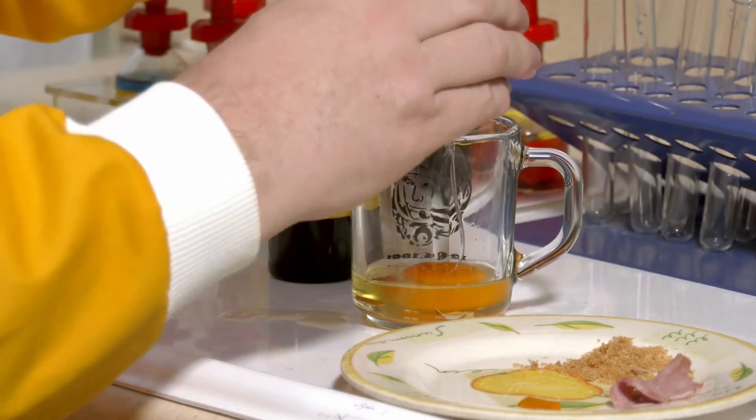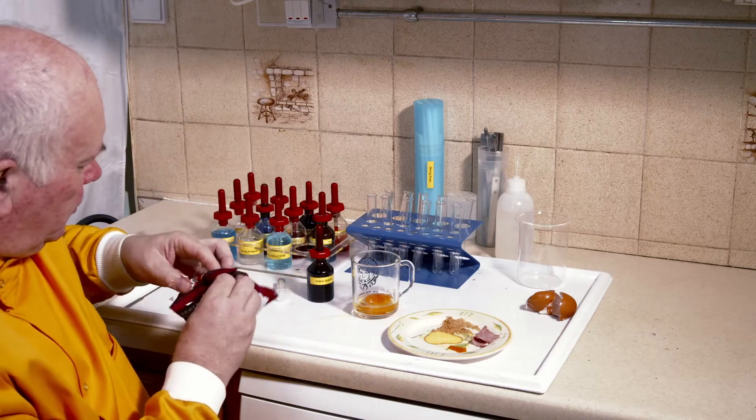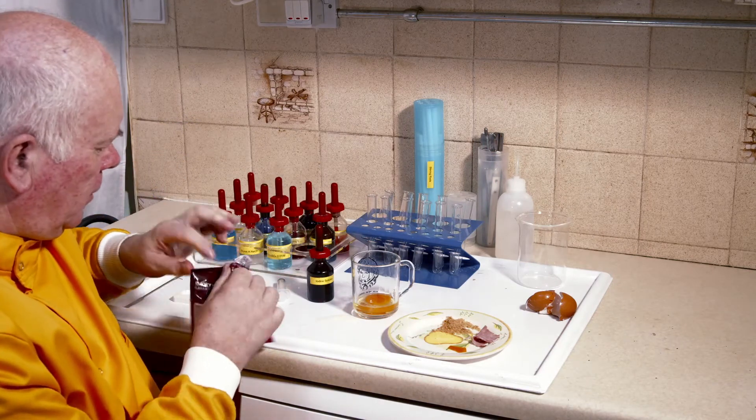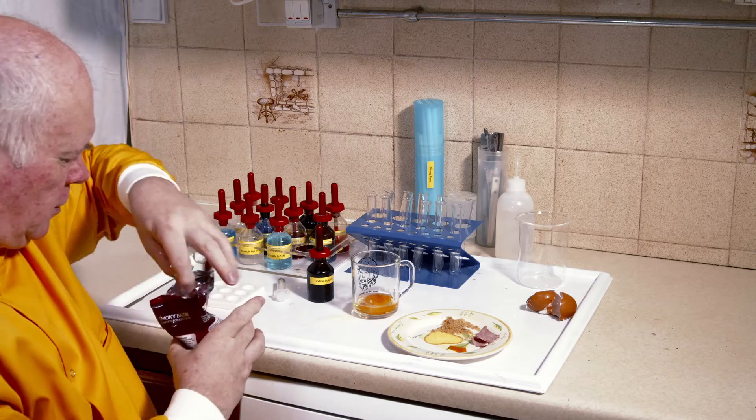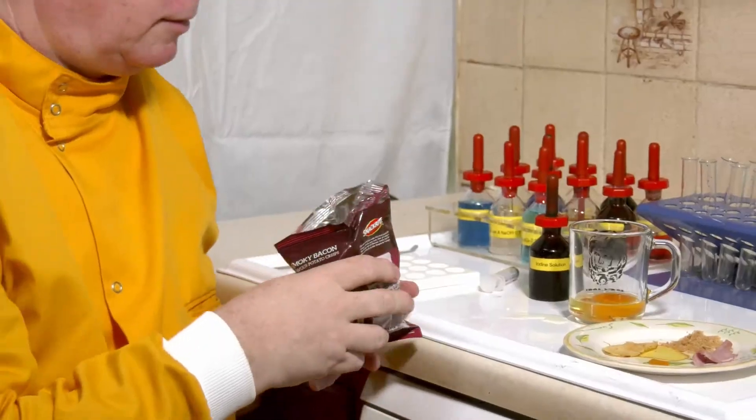I haven't broken an egg that badly in a long time. Just to keep me going, I've got some crisps here that I can have while we get on with the test.